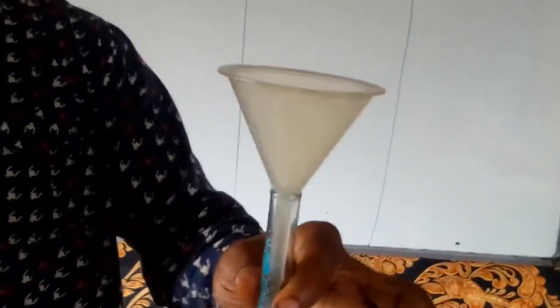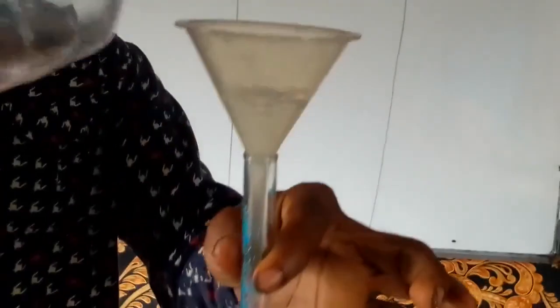Here is a salt with a blue color. We can call it S, the unknown salt. We want to find out the cation present in this salt by testing it with aqueous ammonia. So how do we go about it? We don't use solids with ammonia. We have to first dissolve this salt in water. We fix a funnel here and pour distilled water into this salt and dissolve it first.